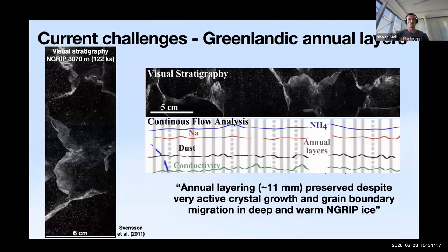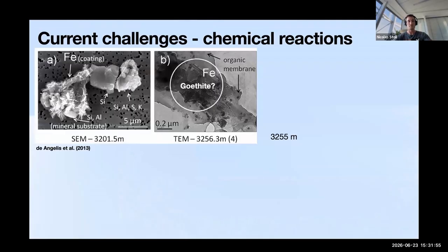And therefore, we're currently trying to look into these samples with laser ablation to see if we can reproduce these results. And it's quite interesting because we already see that those samples, they have been drilled more than 30 years ago. Some have bubbles that appeared in the ice because the pressure is gone from the ice sheet surrounding it, and all the impurities are collecting in the bubbles. And this might, of course, impact your climate signal quite a bit. So it's not sure if they measured the bubbles here, and this is all ongoing and quite interesting. We'll see in a few months to years. You might know what really happened here.